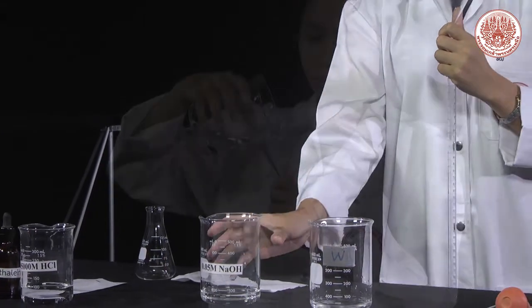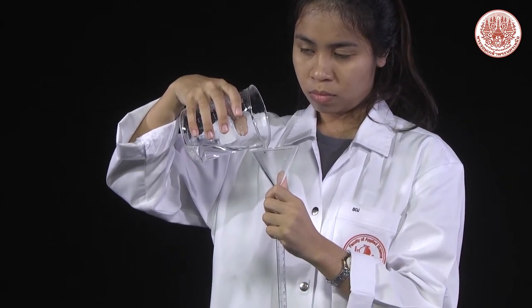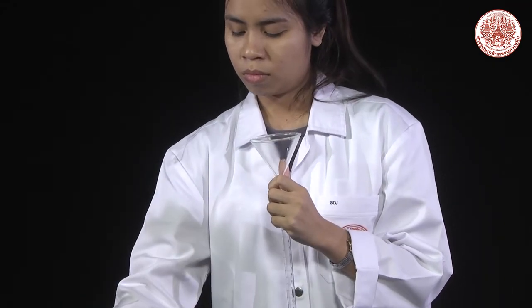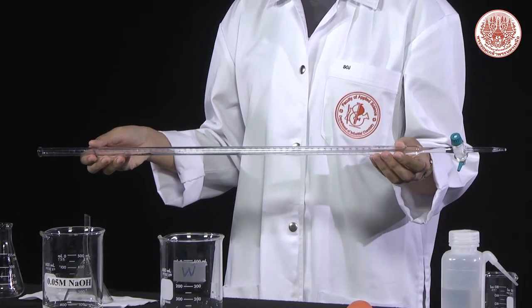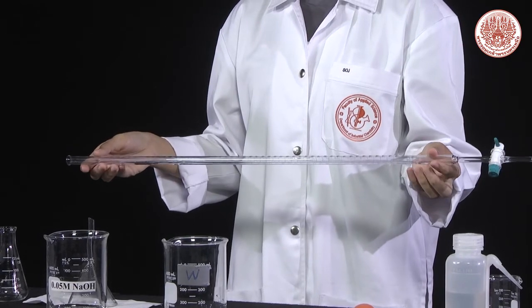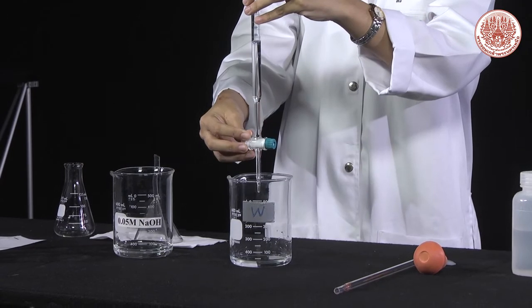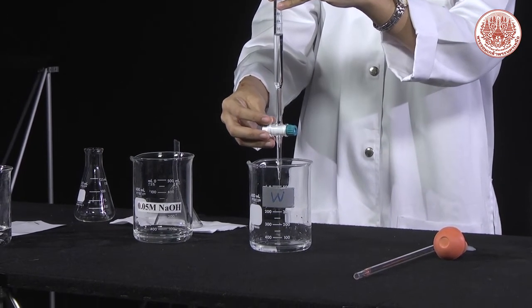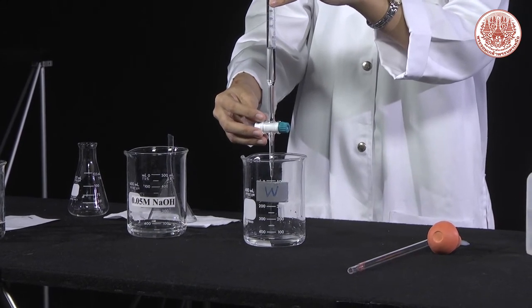Do the same rinse as with water but use sodium hydroxide solution instead. By adding 5 ml of sodium hydroxide solution, rinse to allow the sodium hydroxide to contact the entire inside surface of the burette. Then drain the rinse through the tip into a waste container. Now, the burette is cleaned with sodium hydroxide solution.